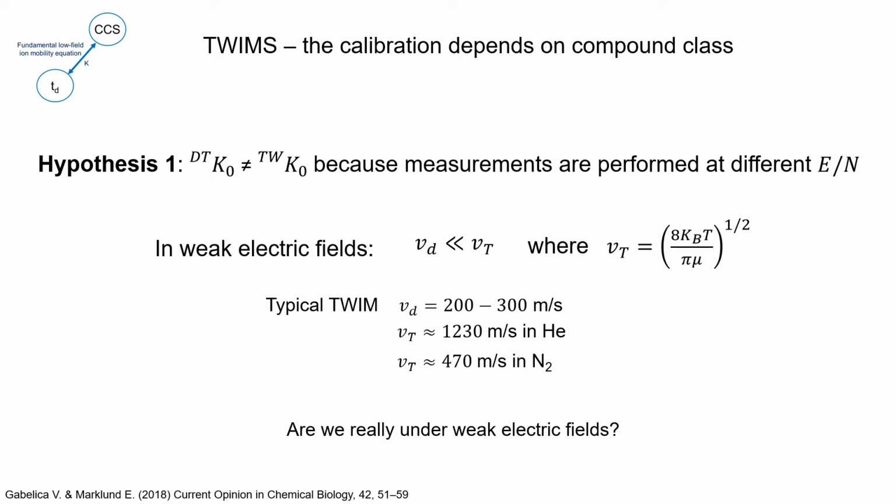In fact, ions are pushed and accelerated by the wave at first, but then they eventually get overtaken, larger ions more than smaller ions, and there is a moment when the modulus and direction of the velocity is zero or even negative. This is basically the principle of separation in traveling wave ion mobility.